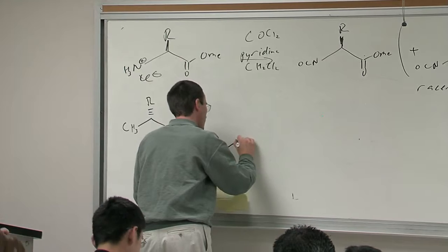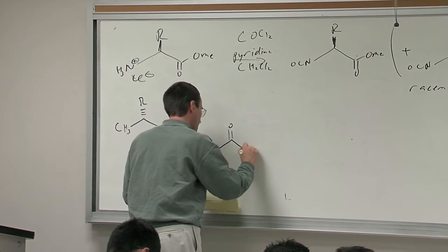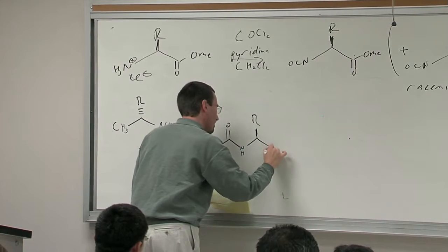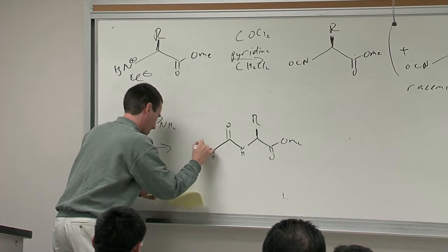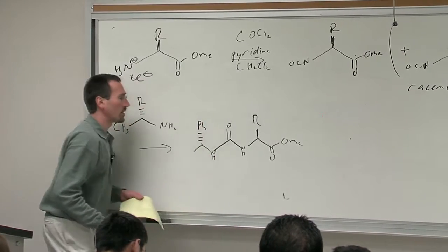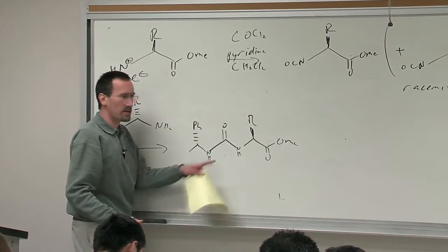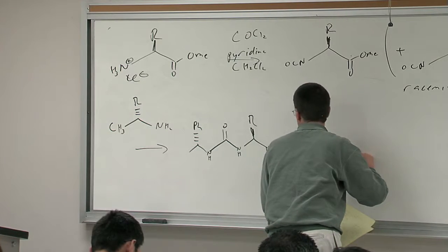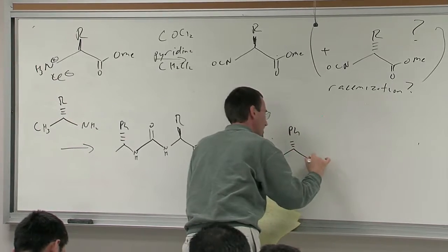And so you could look at the diastereomers by NMR and say, OK, are we seeing any evidence of the diastereomer? And so this is what you'd get from the compound with the natural stereochemistry. And so the question is, are we getting any of the diastereomer?